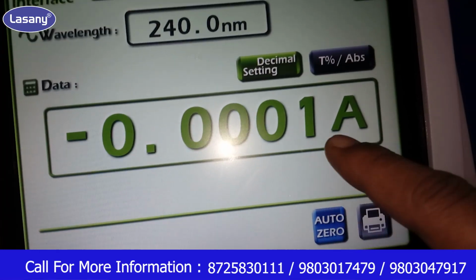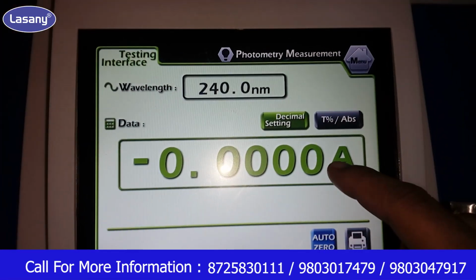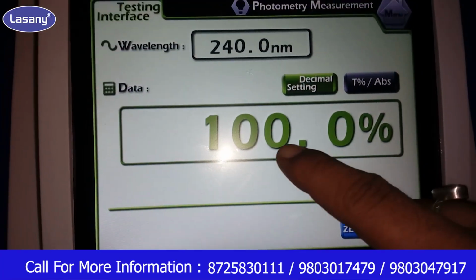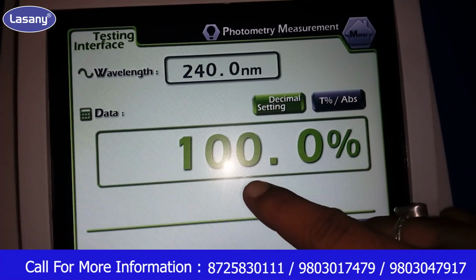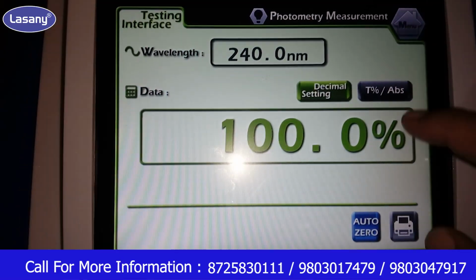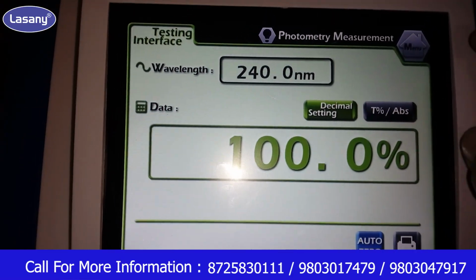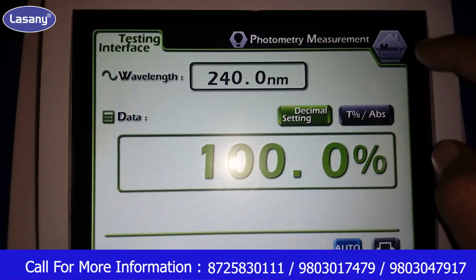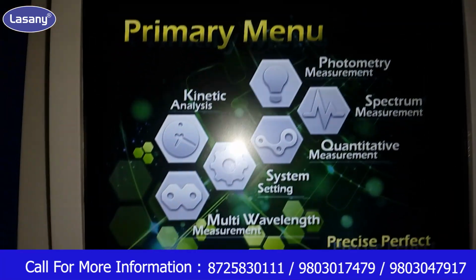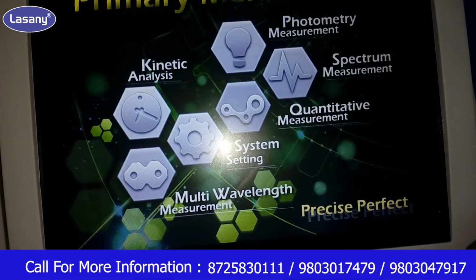This is absorbance mode, and if you want to take the transmission reading, just press this button. The data will automatically convert into transmittance mode. So this is it for photometric measurement. After that, to go back to the previous menu, the main menu, just touch on the menu. This is our main menu again.